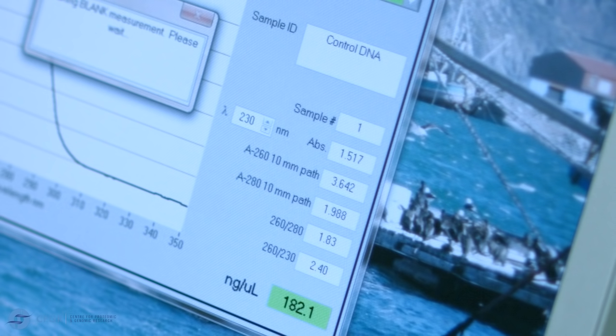Running buffer, in this case 1x TBE containing ethidium bromide, is added to the tank. The gel is lowered into the gel tank and the samples, together with the high molecular weight DNA ladder, are loaded onto the gel.